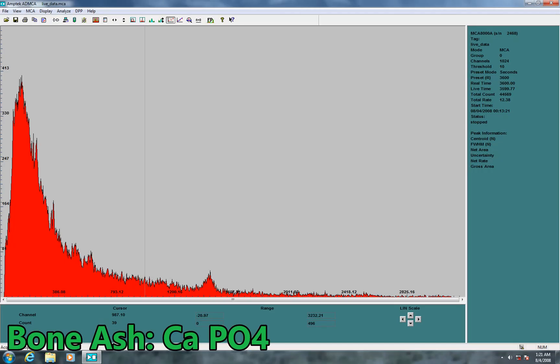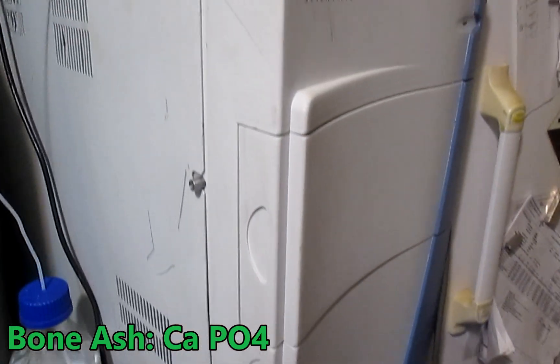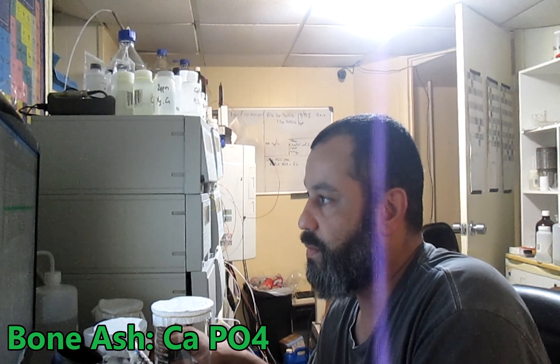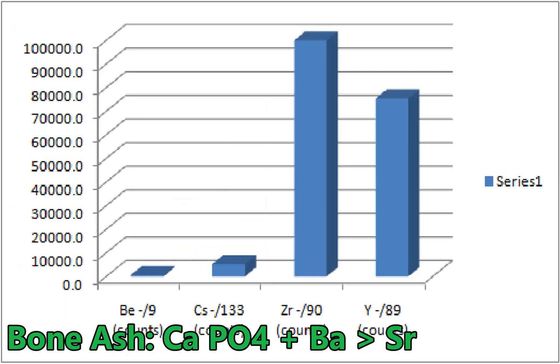Outside of the background radiation, I could not pick up any radioactivity. Rather than give you a long boring list of numbers, I put my mass spectrometer data in a more visual Excel chart — easier to digest. For some reason, barium seems to be the dominant trace metal present in this bone ash, which is both suspicious and unusual. Strontium is also definitely there, along with traces of yttrium, zirconium, and cesium.